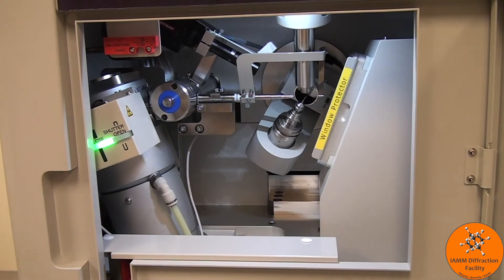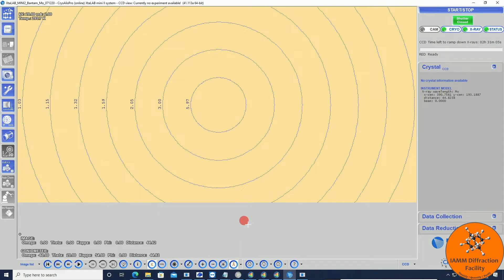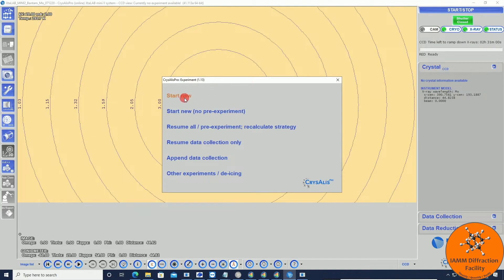If a previous measurement had been run, we can just click start stop, and then we can click start new.